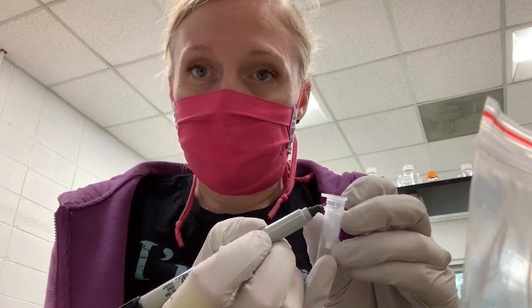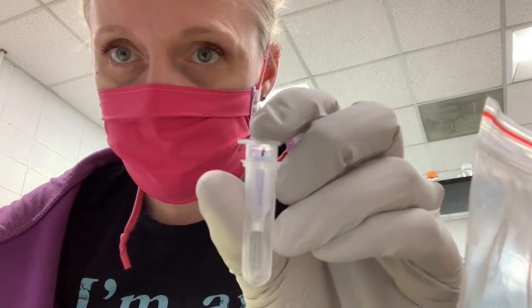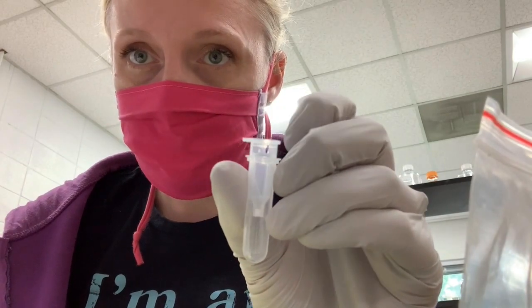And you need to label these tubes. So if you have 10 or whatever different samples that you're going to purify at the same time, you don't want them to get mixed up. So I label the side of the column, not the collection tube, because they can get mixed up. So I just have 20 samples. I'm numbering them 1 to 20. So I'm going to label this one 1, just like that.